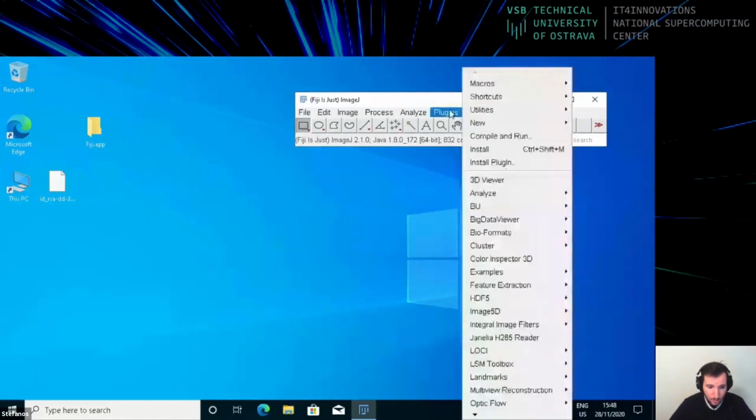So now, as you can see, first on the desktop, I have placed my key file, the ID RSA, and then dash DD and so on, which is the username, the last part. So it's ID RSA and then the username. I have placed it on my desktop. You don't need to place it on your desktop, but I would like you to have this file ready because we're going to be using it in this section.